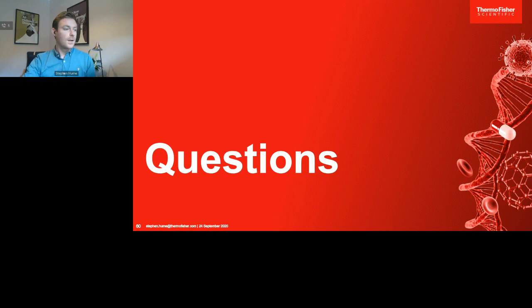So, Pirkko, I think we're going to come to you for the first question here. We've got lots of questions to get through. First one for you, Pirkko. Can you mix different peptones together?